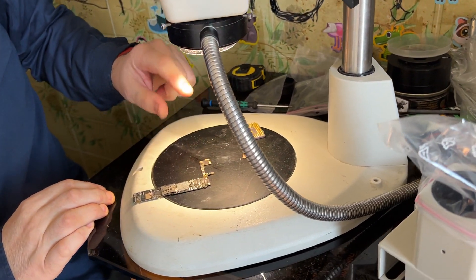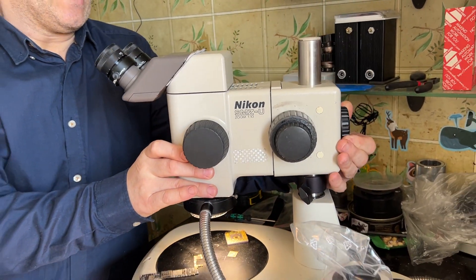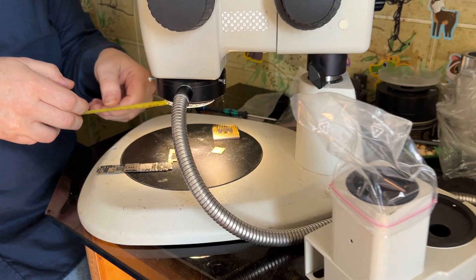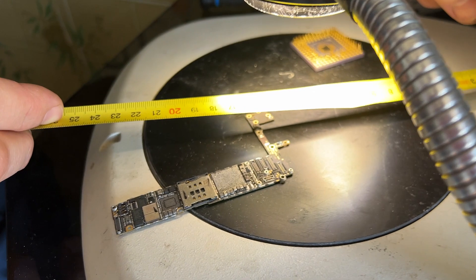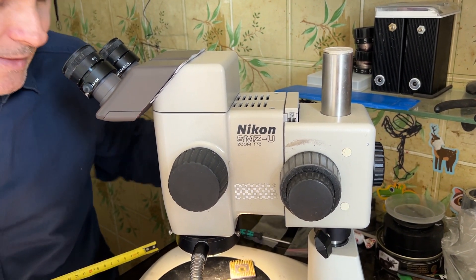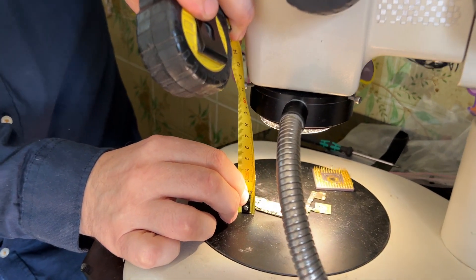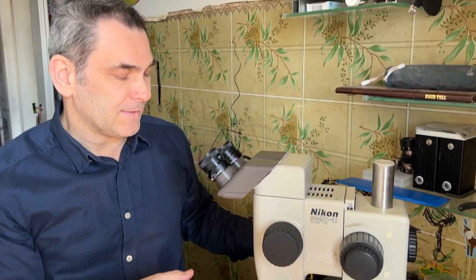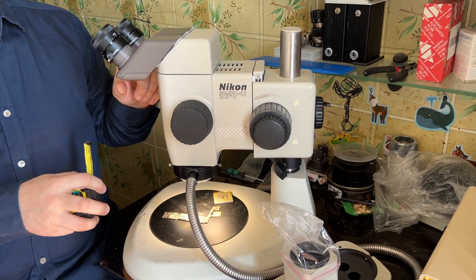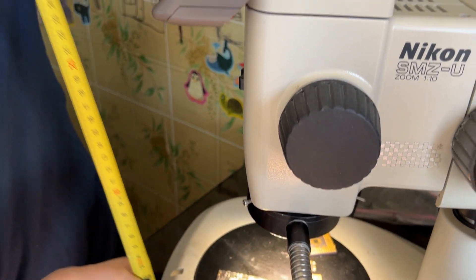It has fine tuning dial as well as a normal dial. In our case we can put pretty high objects here. When we put our focuser block on the upper position and then move it to the working position, we still have nine centimeters of working distance and a nice big space — about seven centimeters from the limiter on the pole. Our normal working height is eight centimeters, frankly about 82 millimeters working height with a 1x plan objective. Looking at the height from the working place to the eyepieces, it is about 33 centimeters.